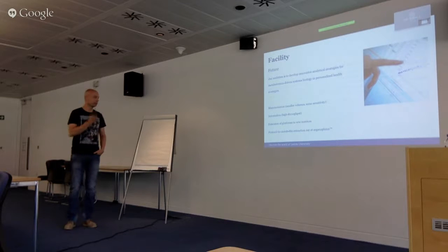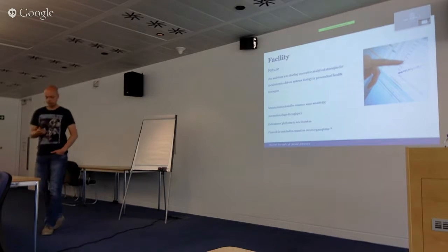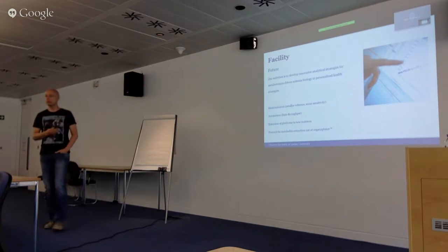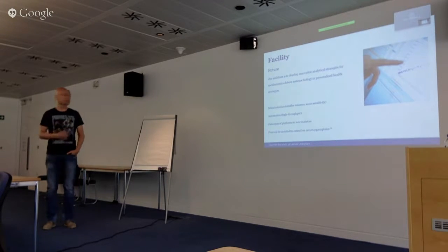In the future, what it states on our website is that we have the ambition to develop analytical strategies and focus towards personalized health. Challenges, or topics that we encountered and are working on, are miniaturization, like it says, smaller volumes, same sensitivity. We want to have higher throughput. Quite a large facility, but a lot of it is done by hand. All the intermediate steps are checked and stopped.